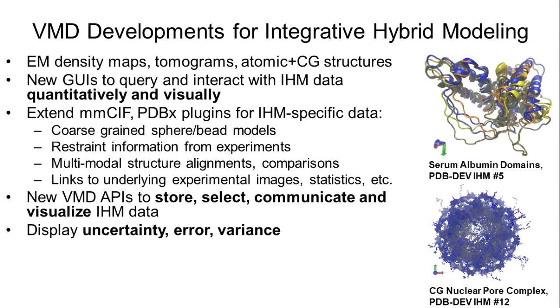And they have machine-readable information for linkage to things like cryo-electron density maps and other basic experimental information from which the models are derived. And so we want to teach VMD to be able to exploit these new structure databases and the linkage that the new mmCIF and PDBx extensions provide.